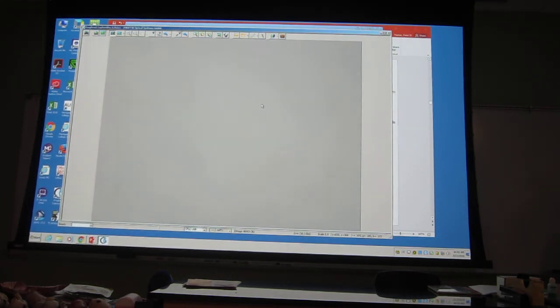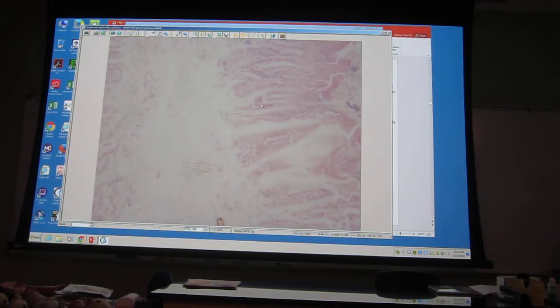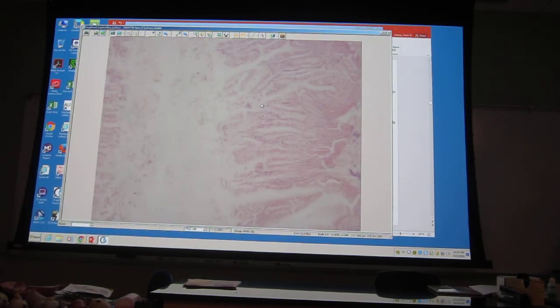Okay, next let's look at the duodenum. I just want to make sure we're still recording and the recording looks okay. Yep.